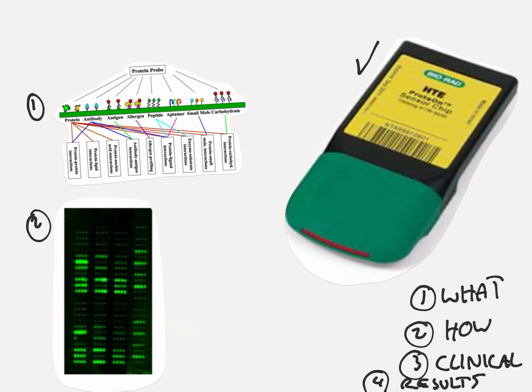They're called that because one of the components is always going to be a protein. So it really depends what type of chip you choose to use. You could use a chip where you have an antibody as the capturing agent, where you have a carbohydrate as the capturing agent. It could be whatever. I'll explain all these terms later. So here's how it's done. We'll take an example to make it clear, but I'll just get the definition part out of the way.